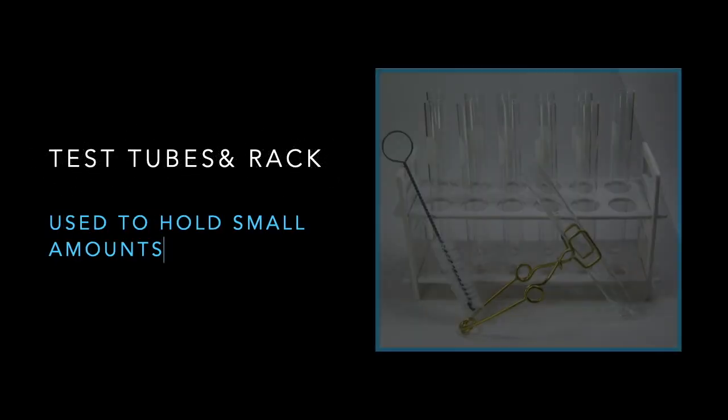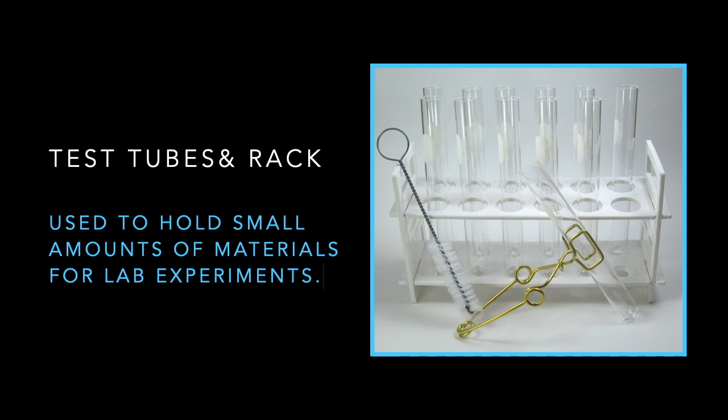Test tubes and rack: used to hold small amounts of materials for lab experiments.